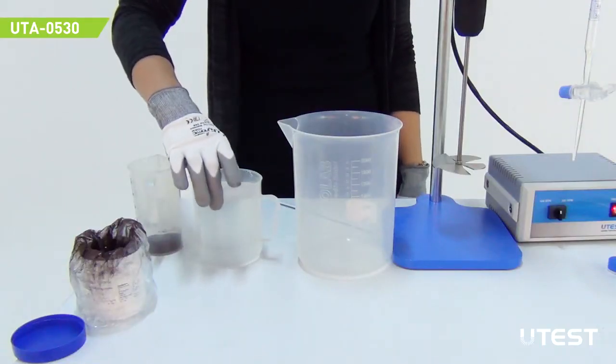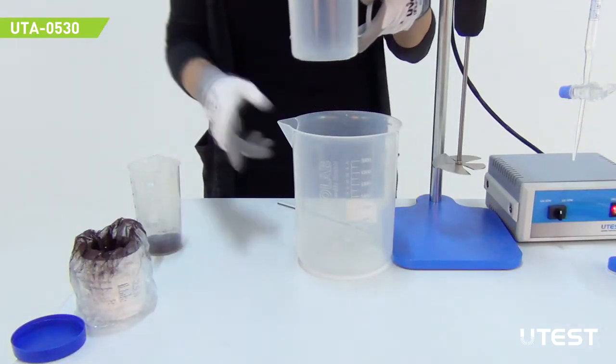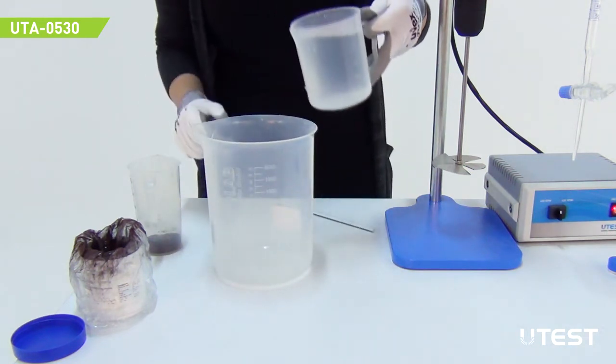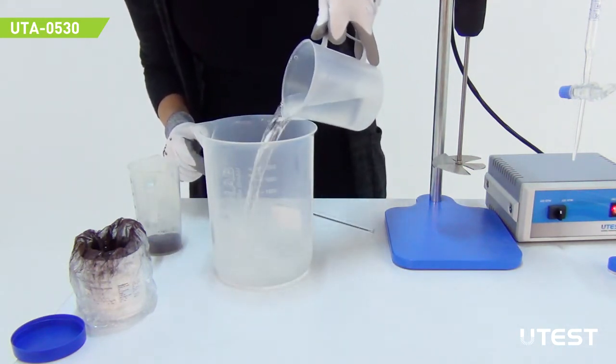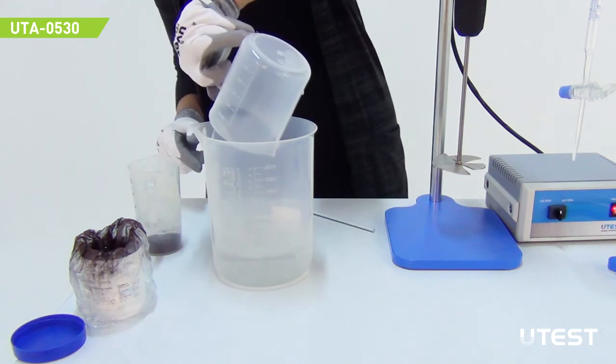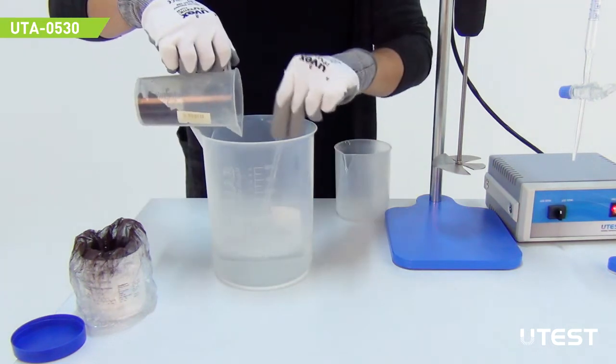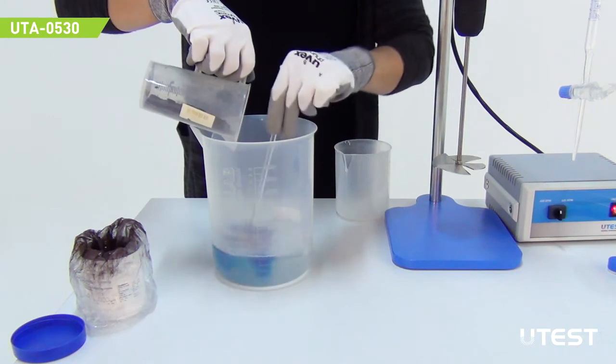Before starting the methylene blue experiment, a methylene blue solution should be prepared. To prepare a 10 gram per liter dye solution, add 500 ml of distilled or demineralized water to the beaker at 40 degrees Celsius.